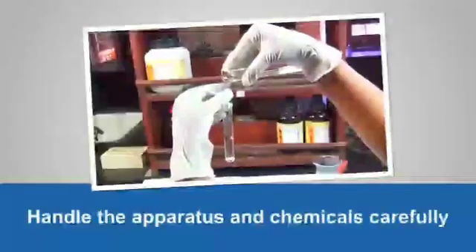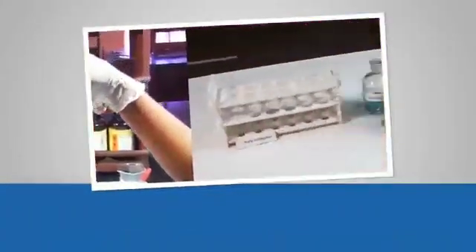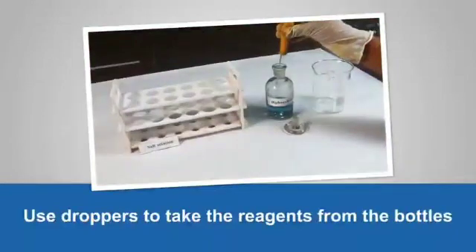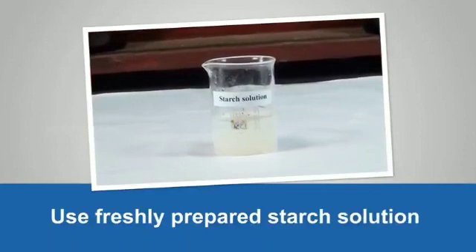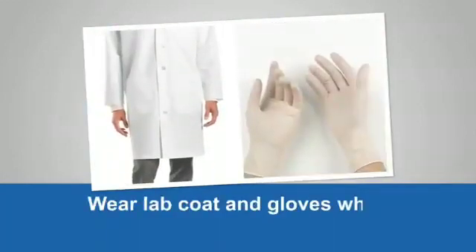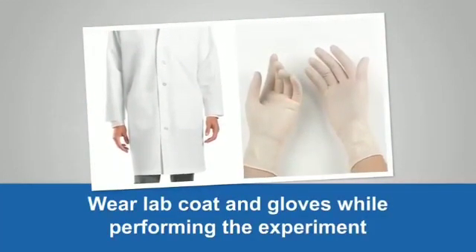Precautions: handle the apparatus and chemicals carefully. Use droppers to take reagents from the bottles. Use freshly prepared starch solution. Wear a lab coat and gloves while performing the experiment.